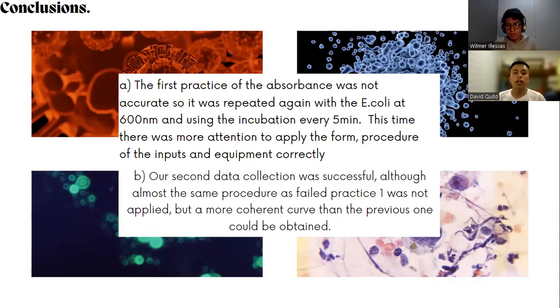Well, finally, I will talk about the conclusions about this practice. The first practice of the absorbance was not accurate, so it was repeated again with the E. coli at 600 nanometers, using the incubation every 5 minutes. This time there was more attention to applying the procedure of the inputs and equipment correctly.